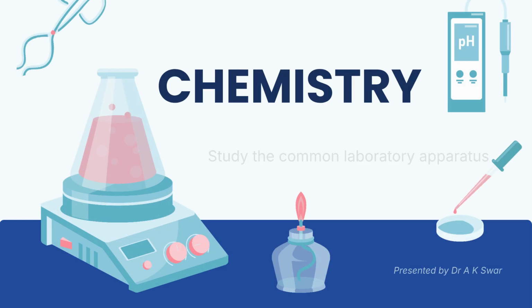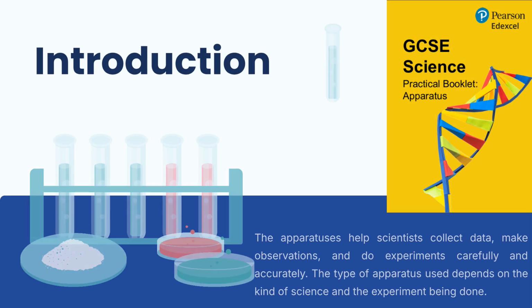Welcome to this video on laboratory apparatus. We will be studying the common tools used in chemistry experiments. Laboratory apparatuses are essential for scientists to collect data, make observations, and conduct experiments accurately. The apparatus used depends on the experiment and the field of science.